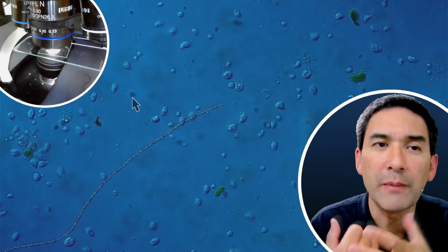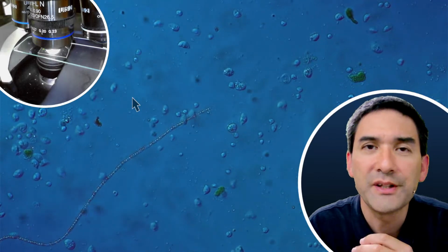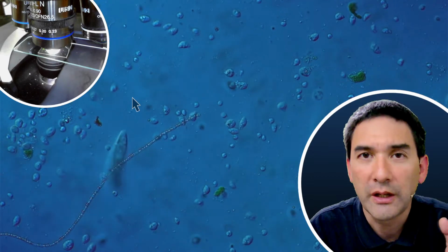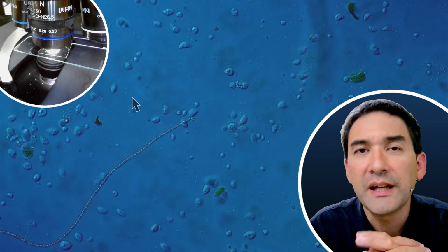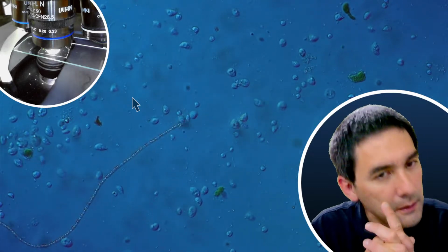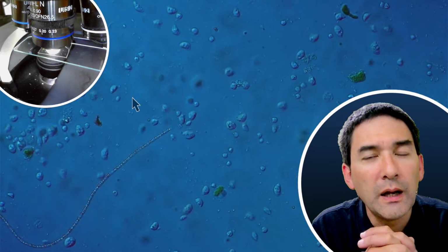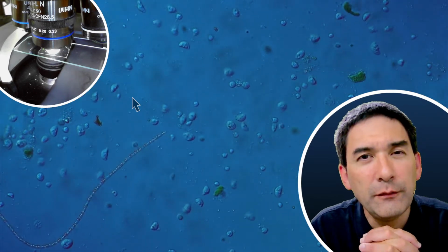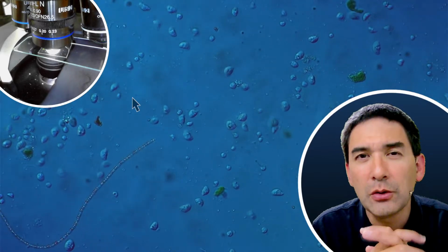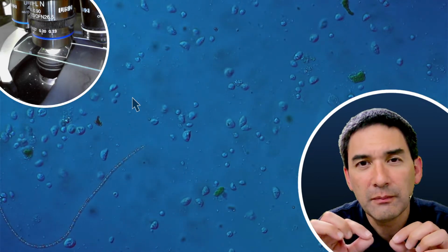Those inverted microscopes are very often used in cell culture. When you're growing, for example, human cells in a Petri dish, then they can be observed. So that is primarily the advantage that they have. The thing is, I've not tried it, but I think for very small specimens it might not be so suited, because the Petri dish itself is thicker than the cover glass.